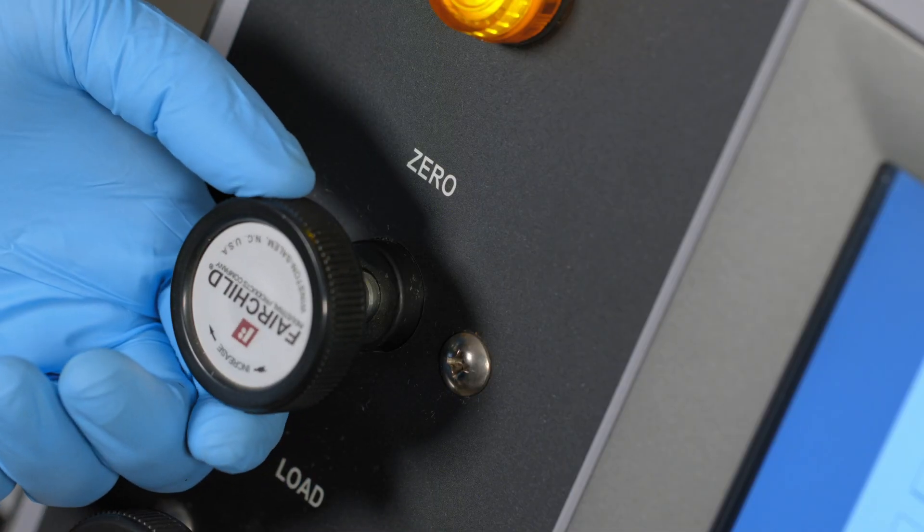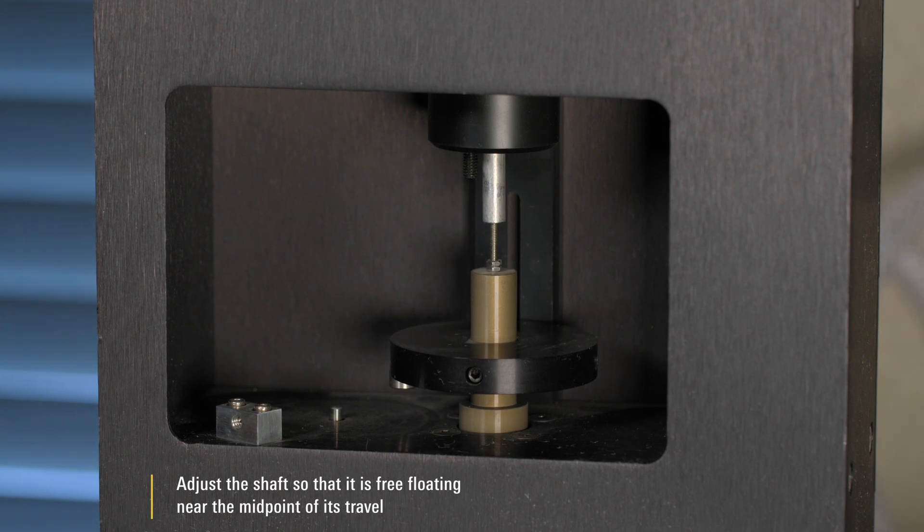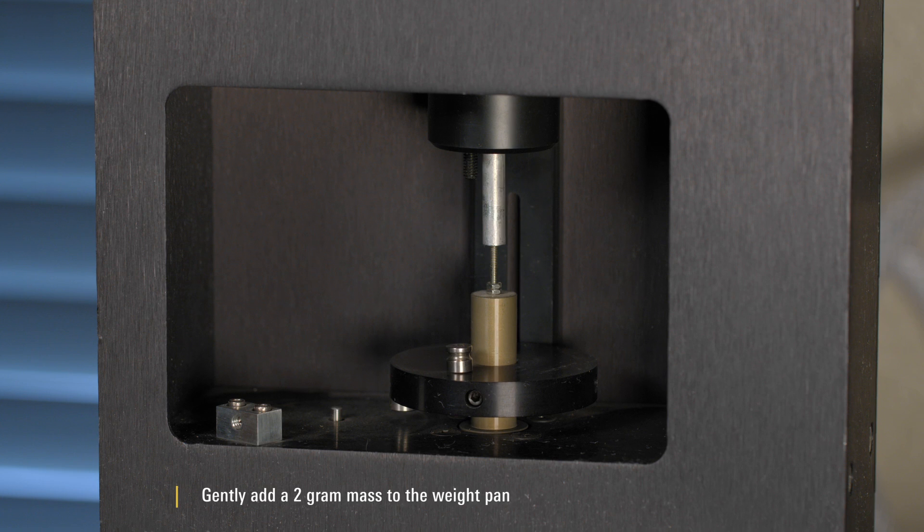Remove any beams from the supports. Using the zero regulator, adjust the shaft so that it is free-floating near the midpoint of its travel. Gently add a 2 gram mass to the weight pan. It should drop under the mass.